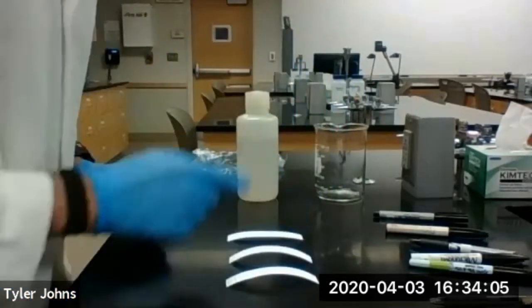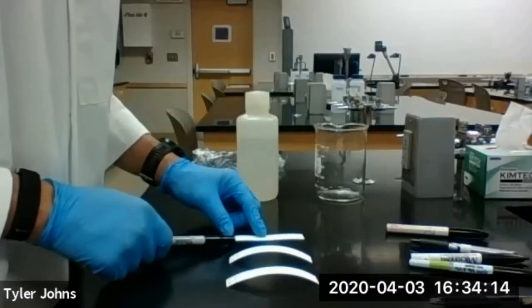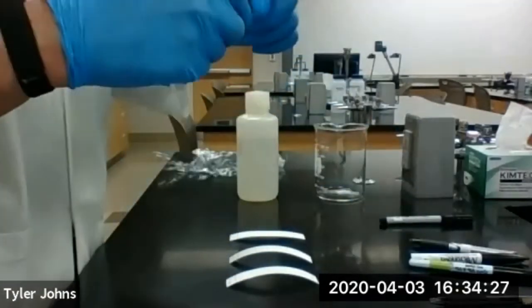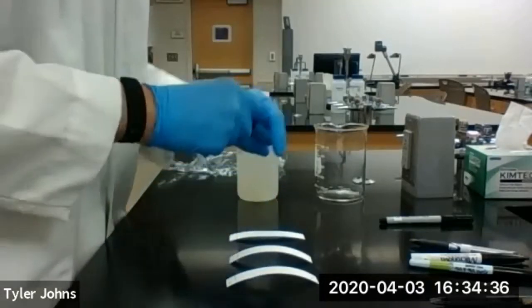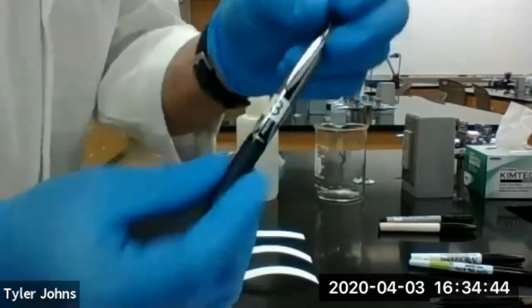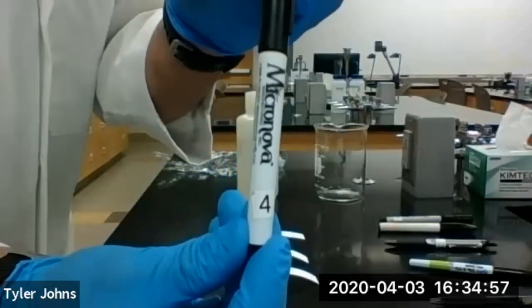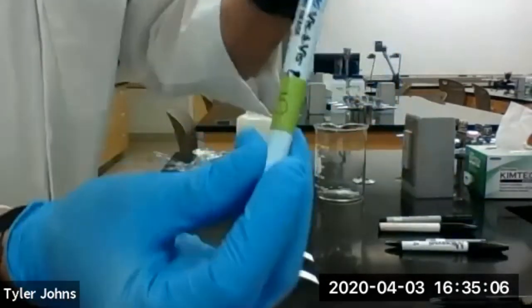We can run two suspects' pens on one piece of chromatography paper. Now we're going to take our pens and spot them at the bottom on the line that we drew one centimeter up. Suspect one was using the Sharpie. Suspect two's pen. Suspect three's pen — they're using something fancy. Suspect four's pen. Suspect five's pen.